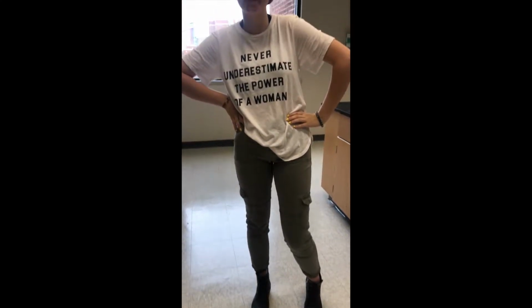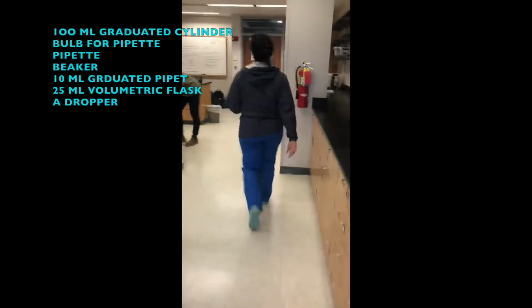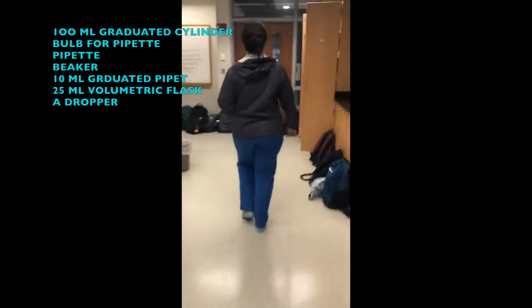Before beginning the lab, be sure you are wearing closed-toed shoes, long pants, lab goggles, and any loose hair is tied in the back. Next, we collected all the materials that were needed to complete today's lab.